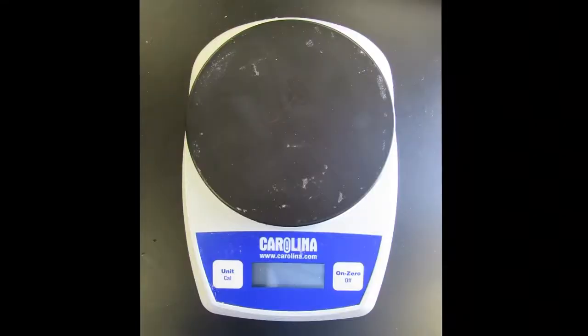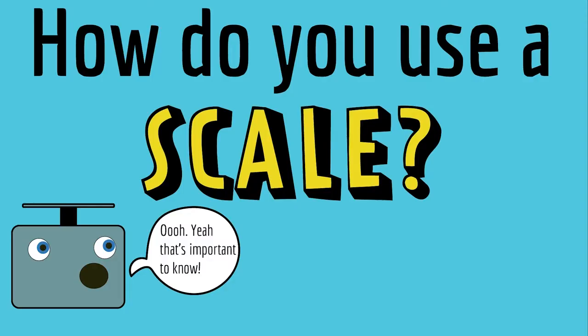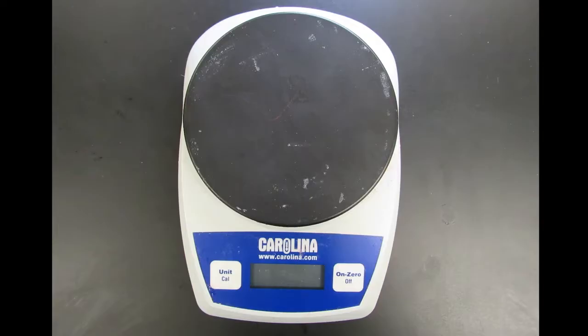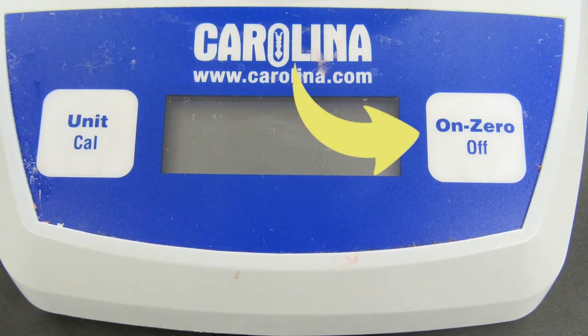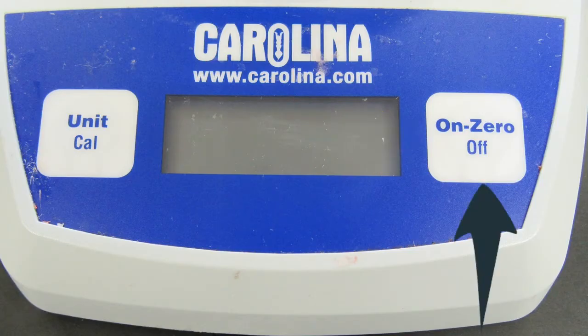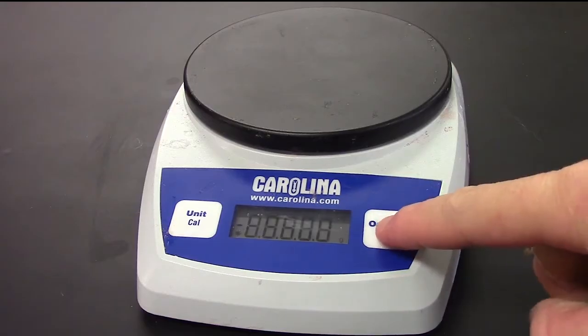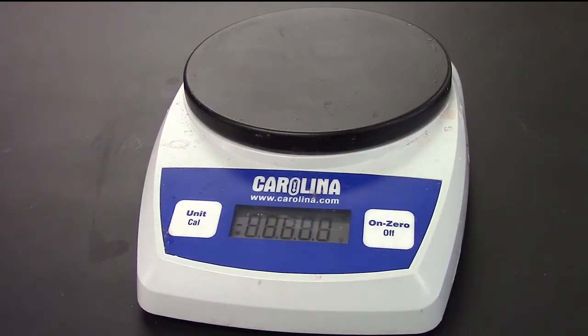Today we will show you how to properly use a scale, just like the scientists who conducted the experiment. There are many different types of scales, but they all have the same basic features. There is an on and off button, and there is also a button that will set the weight on the device to zero, or tare it. When you go to weigh something, you have to turn on the scale and allow it to calibrate.